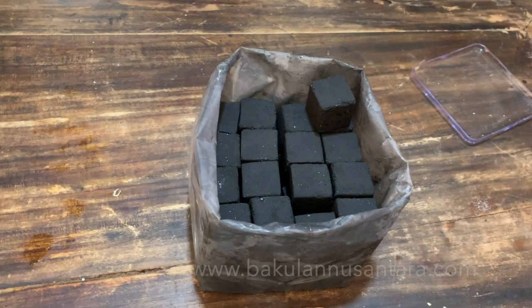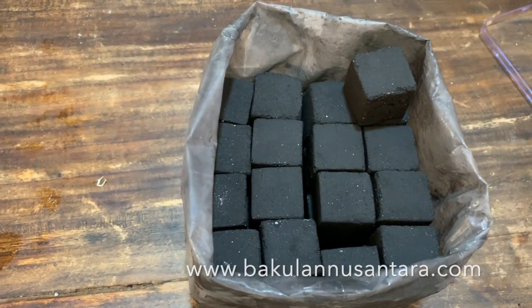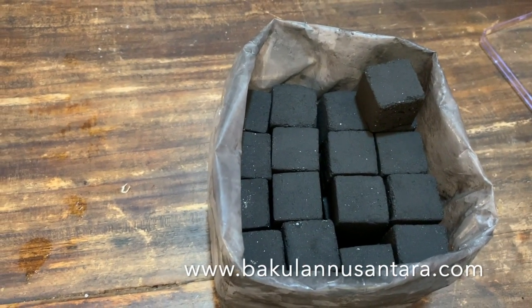Welcome. Today we're going to measure the ash content of these 25 by 25 millimetre coconut shell charcoal cubes.